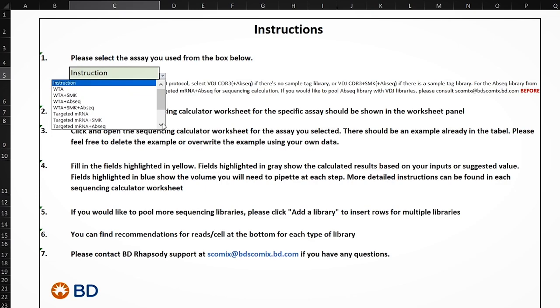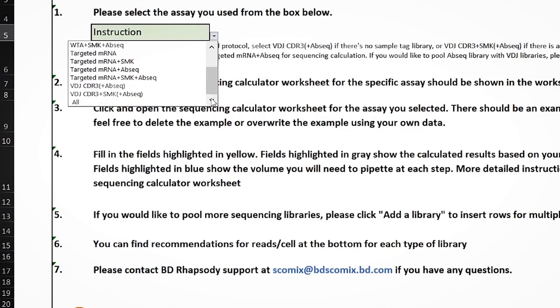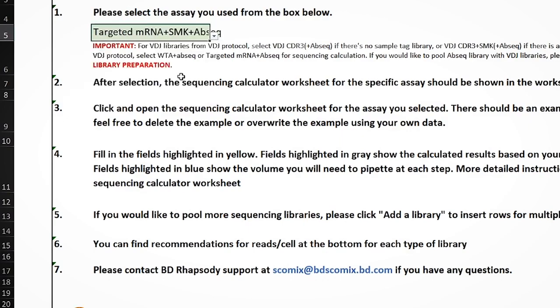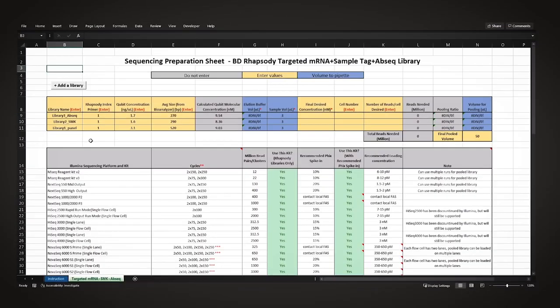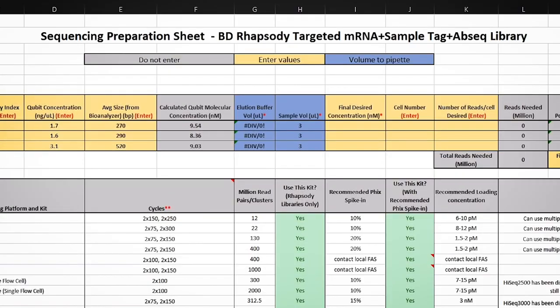With the sequencing calculator open, choose the configuration that matches your experiment. This will open a new tab where all the calculations will take place. In this example, we are demonstrating sequencing library pooling for targeted mRNA plus AbSeq plus sample multiplexing experiment.